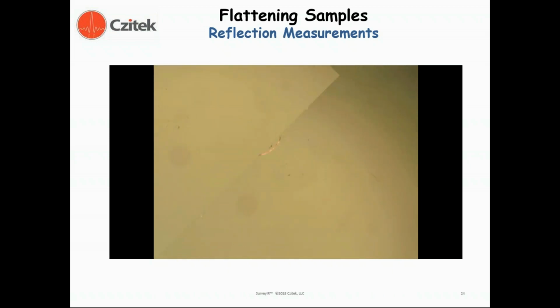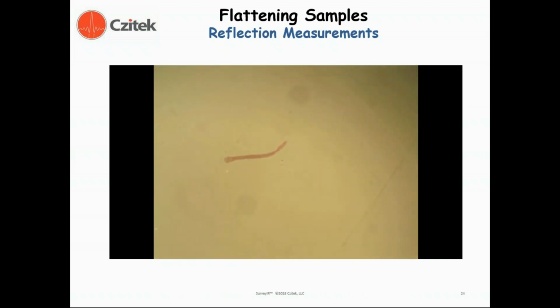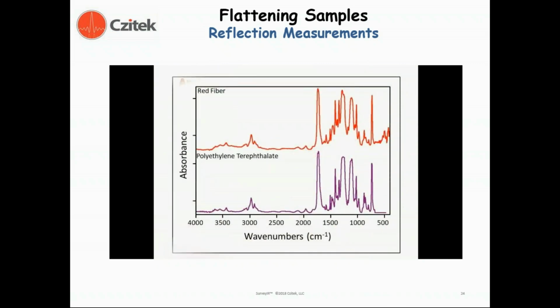on the probe. Next, even though this fiber is very thin, it is optically thick. So for the best quality spectra, we want to thin it and get an appropriate path length. We use a device that I showed earlier called the roller knife. Then we're able to measure the spectrum of that material with very high quality.